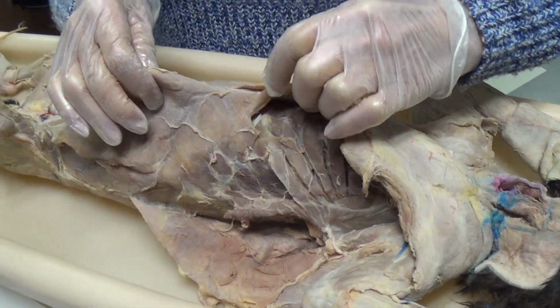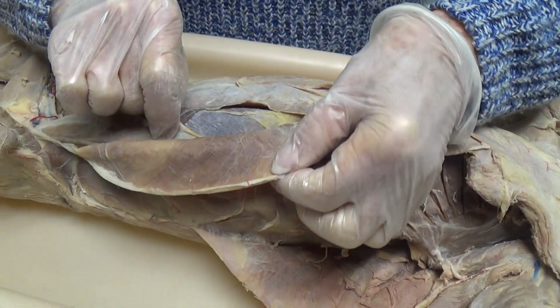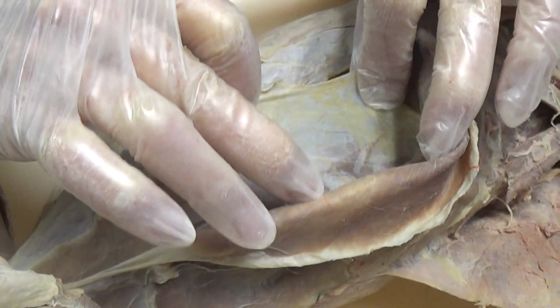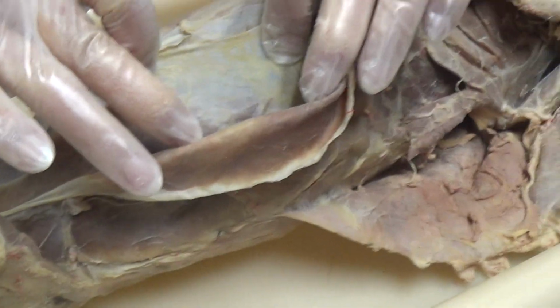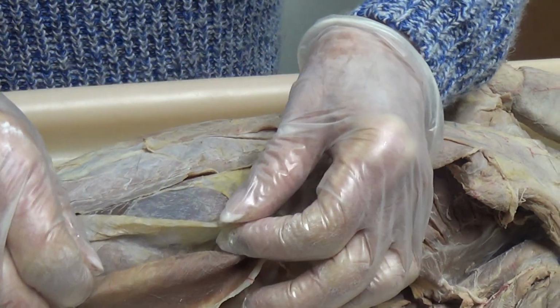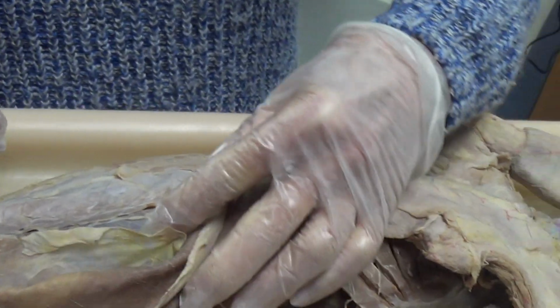Okay. Internal oblique. This one is just barely kind of tucked up underneath. You have to dissect it out thinly away from the external oblique, and honestly, a lot of times it gets pretty shredded on the kitty. Just know where it is and what direction the fibers go. The muscles' fibers head in different directions. That's why you have all those ab exercises.